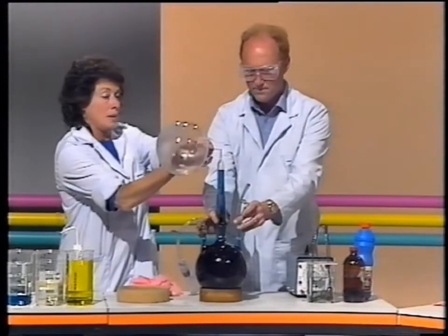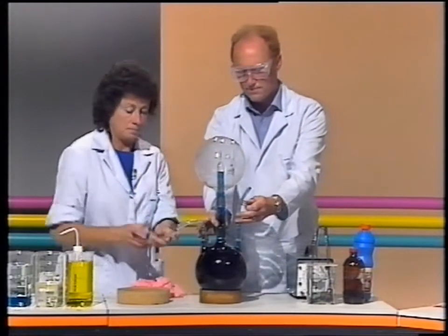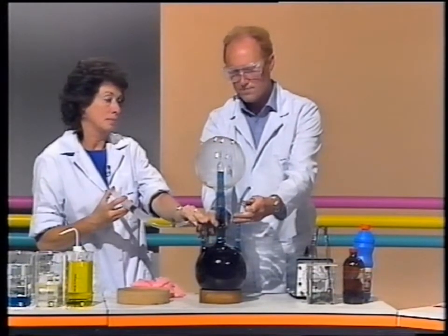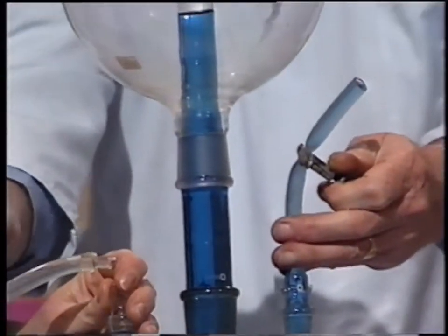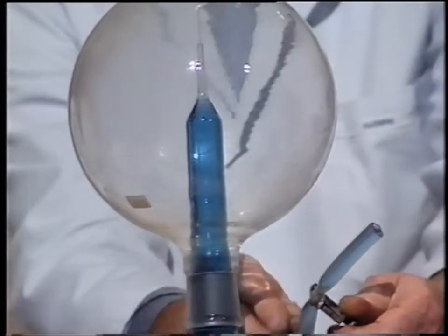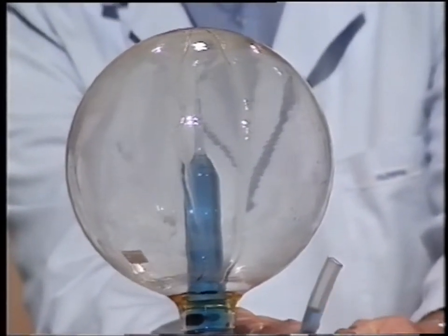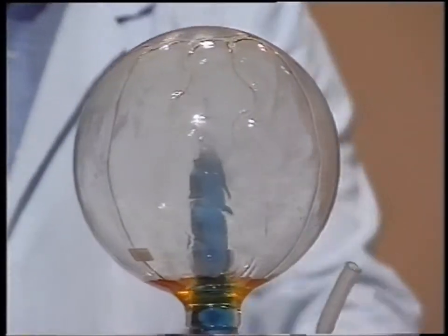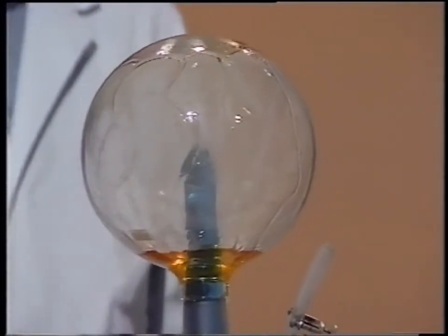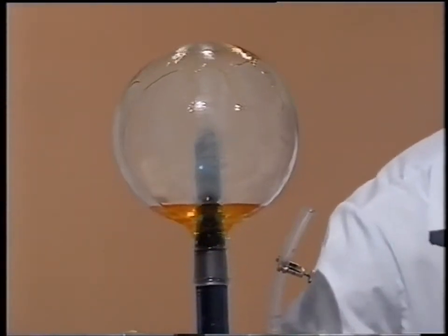In the bottom flask, we've got water that's coloured blue with an acid-base indicator. And in the top flask, we've got some hydrogen chloride gas. So the hydrogen chloride dissolves in the water, it pulls the water up into it, and at the same time it forms an acid solution which changes the colour of the indicator from blue to yellow. And this is a simple demonstration, or a relatively simple demonstration, to show how soluble the gas is.